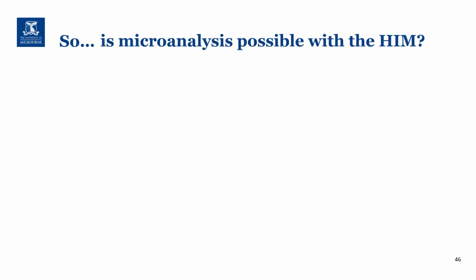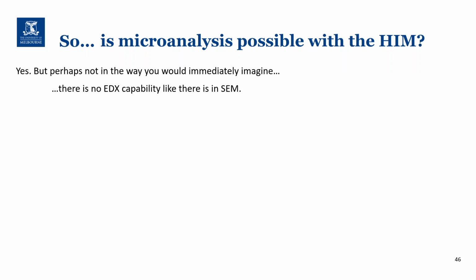Okay, so we're getting towards the end here, but the last thing I wanted to talk about with this webinar is a question that I get asked a lot when I'm introducing people to this system, and that is: is microanalysis possible with the helium ion microscope? Because a lot of people that come to me, of course, have come from SEM. The answer is yes, but it's not the way people think of immediately. It's not EDX. There is no EDX-like capability with the helium ion microscope like there is in SEM.